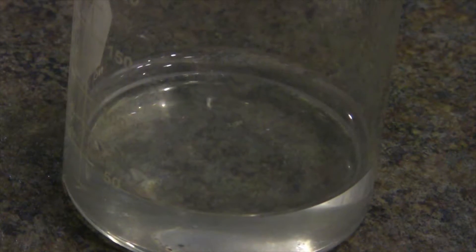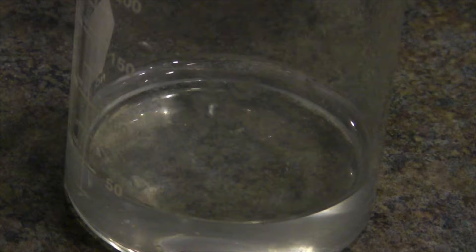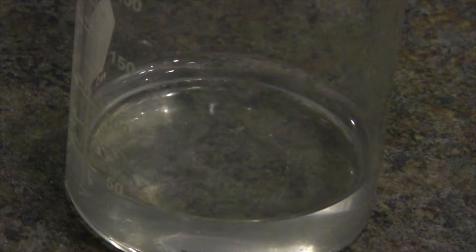Okay, welcome back. Now, we're going to take another piece of sodium and put it into this hydrochloric acid solution that I have prepared.